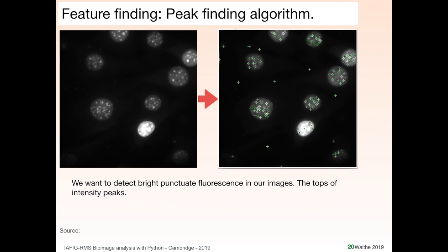So it's, generally speaking, a good relative measure of intensity. And you can see basically you go from the raw intensities more or less straight to the foci, so there's no segmentation of the cells necessary for finding the point. So this is an interesting procedure to understand.